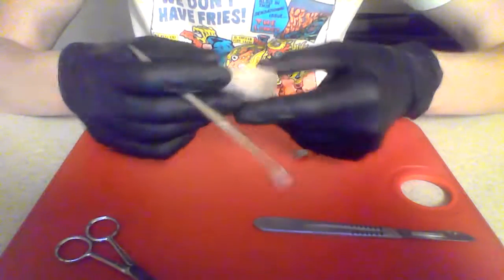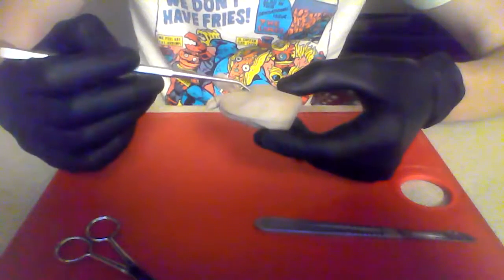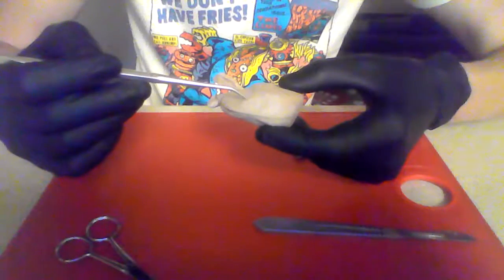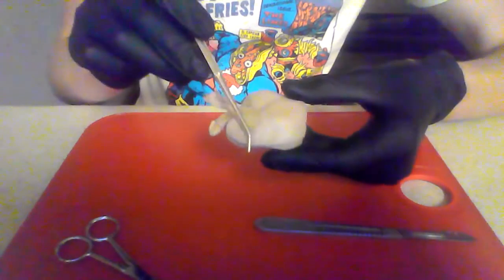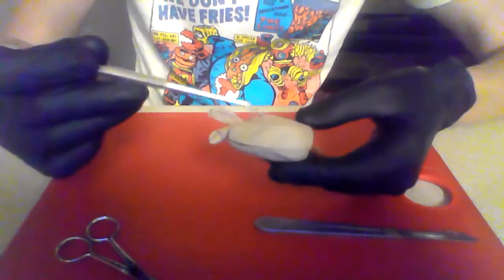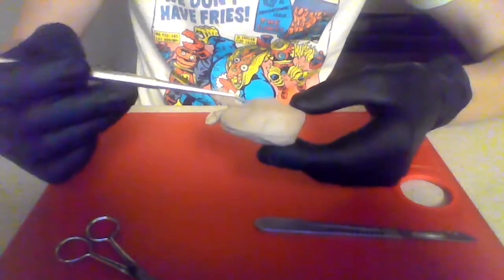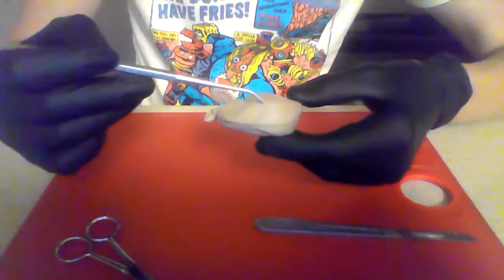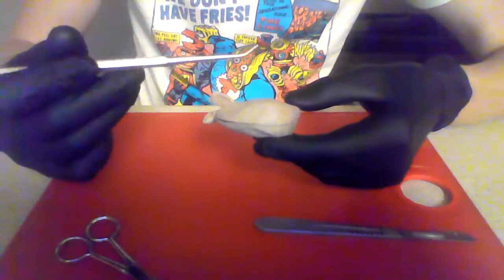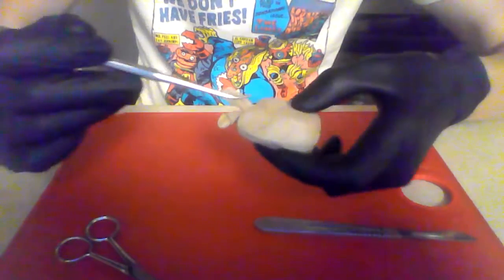There are a few structures that are immediately evident just by looking at the outside of the sheep kidney. The first one is the renal capsule, which is this whole thing. The renal capsule is dense irregular connective tissue. Basically, all it does is protect the kidney and also helps maintain the shape of the kidney.